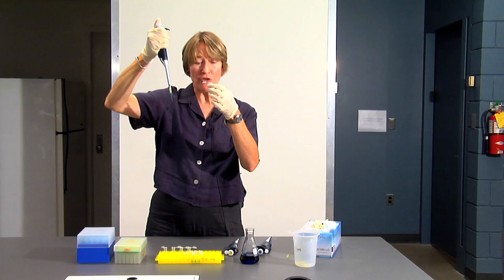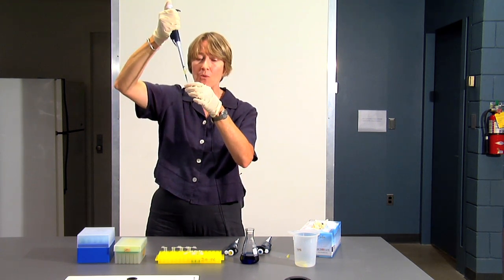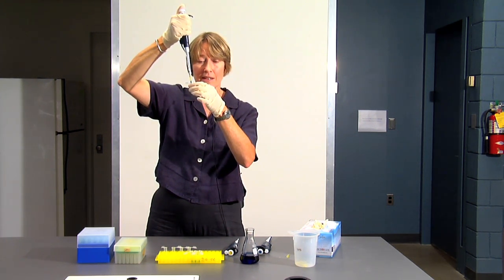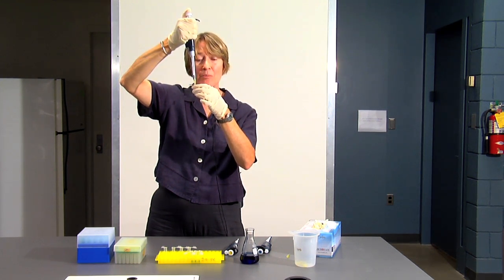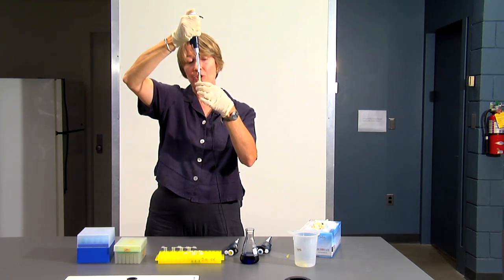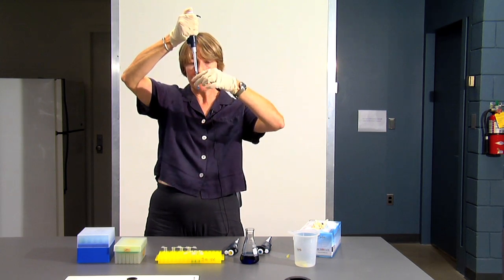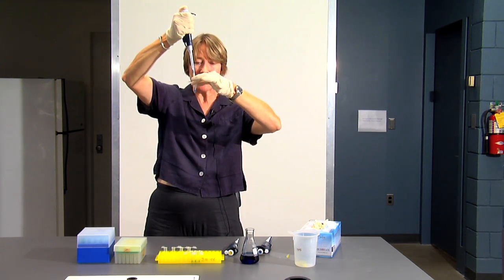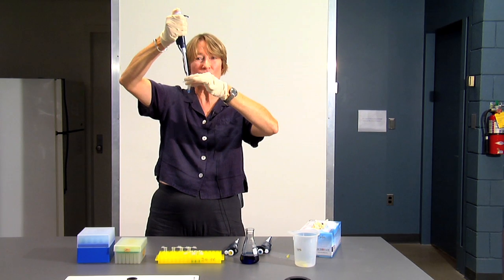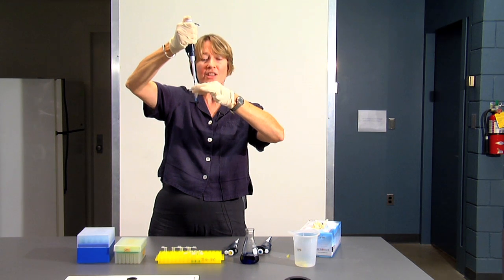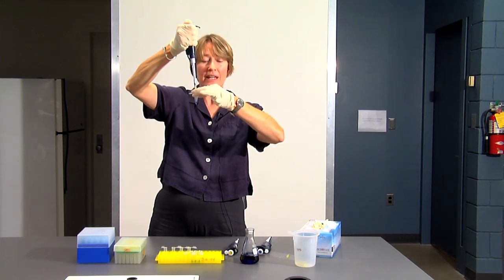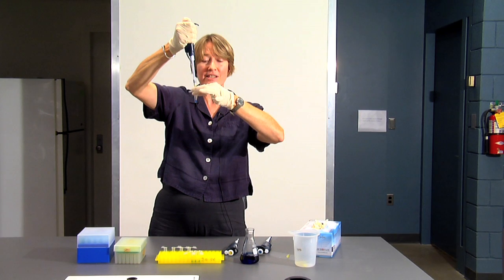I'll then take a microfuge tube and I will put the tip into the tube and I will now depress the plunger again and release the sample into the tube. And you may be able to see that there's just a tiny, tiny drop, hardly even noticeable, still left in the tip of the pipette. This is where you depress it to the second stop to push out that last drop.